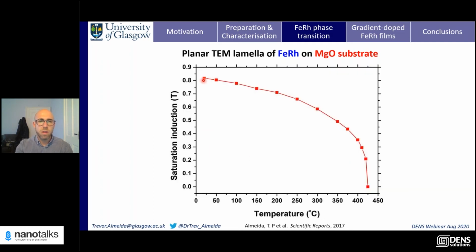So if we chart this as a function of temperature, what we see actually is that at room temperature, it's quite a strong ferromagnetic material, which does not agree with what we'd expect in the transition that I showed before. So we have a very strong ferromagnetic material. As we keep on heating, it becomes paramagnetic, approaching the Curie temperature.